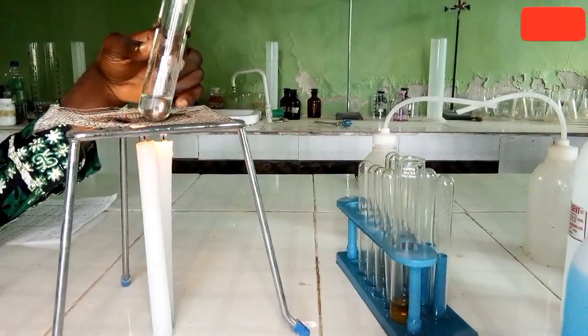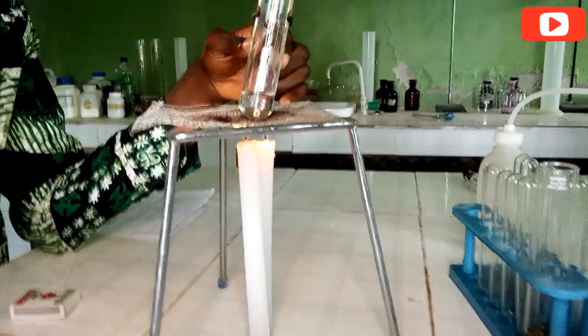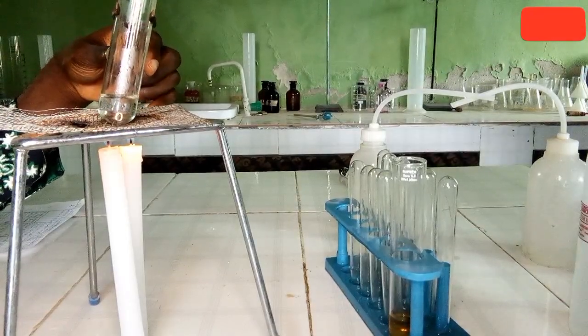So let us heat the solution and see. We are already heating it now, as you can see, with a candle flame. Let's heat and see if there is any response.